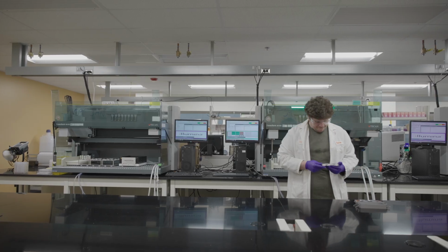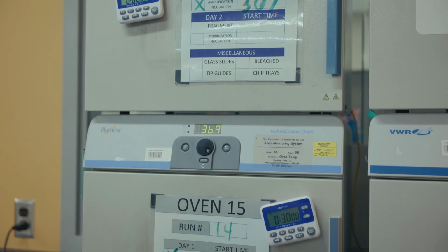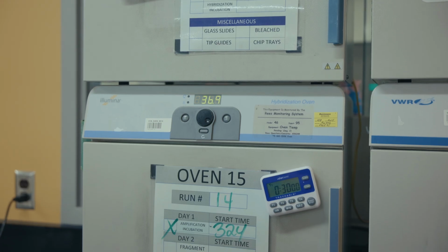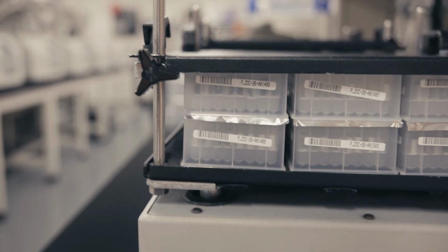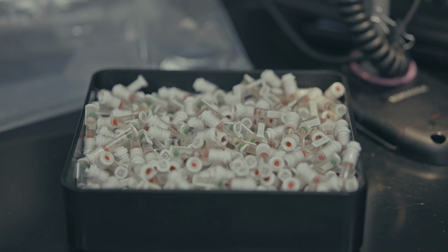And so we understand that it's a priority from customers that these decisions are back in their hands fairly quickly, but there's also some of the balancing that we have to do because of the science behind it. There are times in the process where science can limit us. For example, sit in an oven for 16 hours because that's how long it takes for the science to happen. There are pieces and parts within the process that we can actually adjust, because we've got people that are responsible for it and they can shrink that turnaround time.